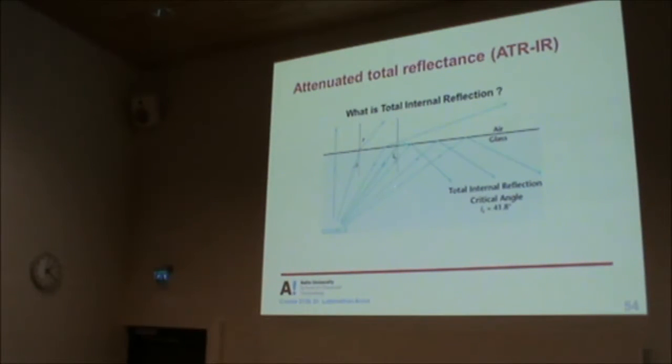Okay, so as the angle of incidence keeps increasing, in the initial periods you have refraction happening, and once it goes beyond an angle called the critical angle, you have reflection happening. The angle above which there is reflection happening is called total internal reflection.